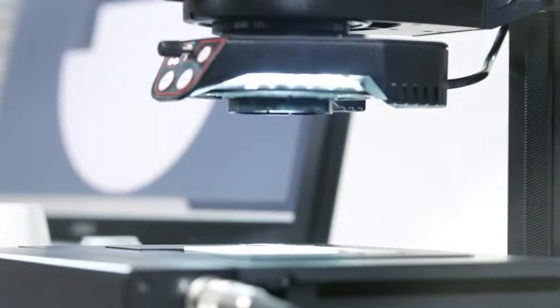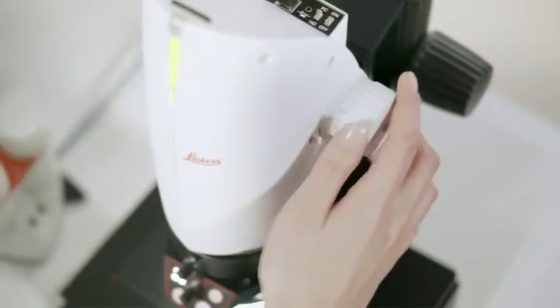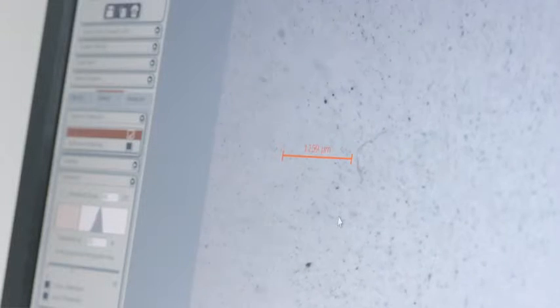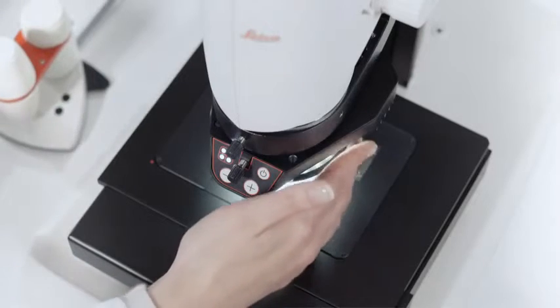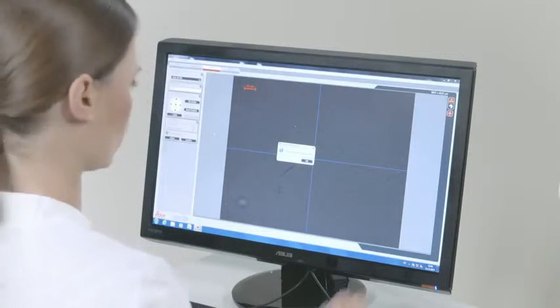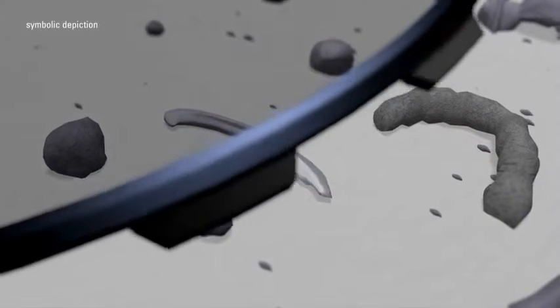The Leica DMS 1000 features an encoded zoom for exact reproducibility of measurements. And it can distinguish between reflective and non-reflective particles, a necessity in many cleanliness inspections.